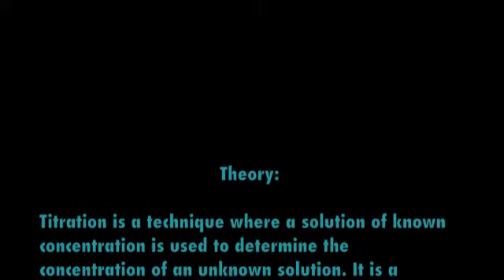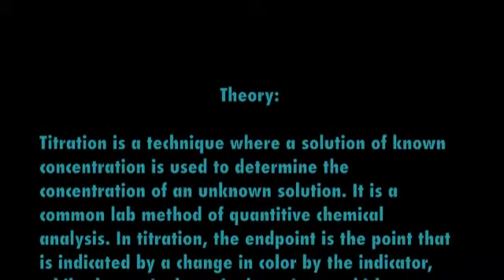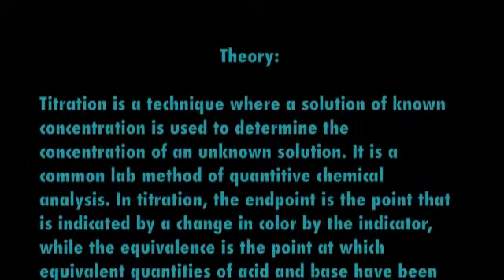Theory. Titration is a technique where a solution of known concentration is used to determine the concentration of an unknown solution. It is a common lab method of quantitative chemical analysis.